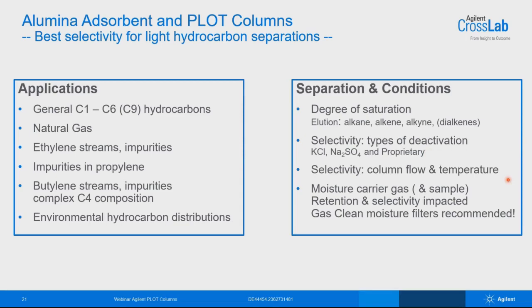My red flag is back. Watch out for moisture in the carrier gas and in the sample. Water is a deactivating agent on alumina, as we've seen, so its presence affects retention and selectivity. Be careful. Use proper moisture filters in the carrier gas. Gas cleaning filters are recommended.